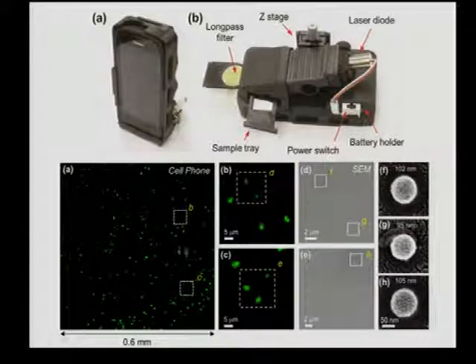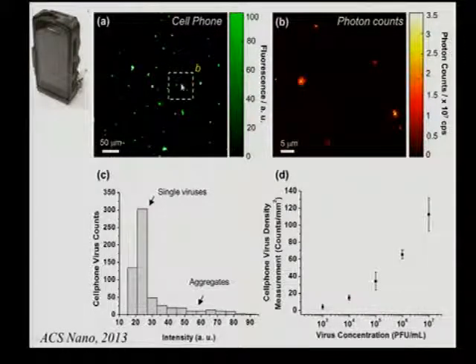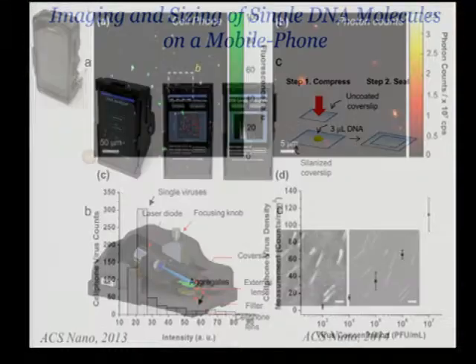where you can actually see these are nanoparticles that are being imaged compared to SEM, and these are actually single viruses that are labeled through their glycoproteins. These are the envelope proteins that are being labeled here. These are human cytomegaloviruses that are individually imaged by a mobile phone, and this is a comparison image captured by a confocal scanning microscope. And you can utilize these kinds of platforms with the correct surface chemistry for viral load measurements, for looking at essentially densities of certain specimen in your sample.